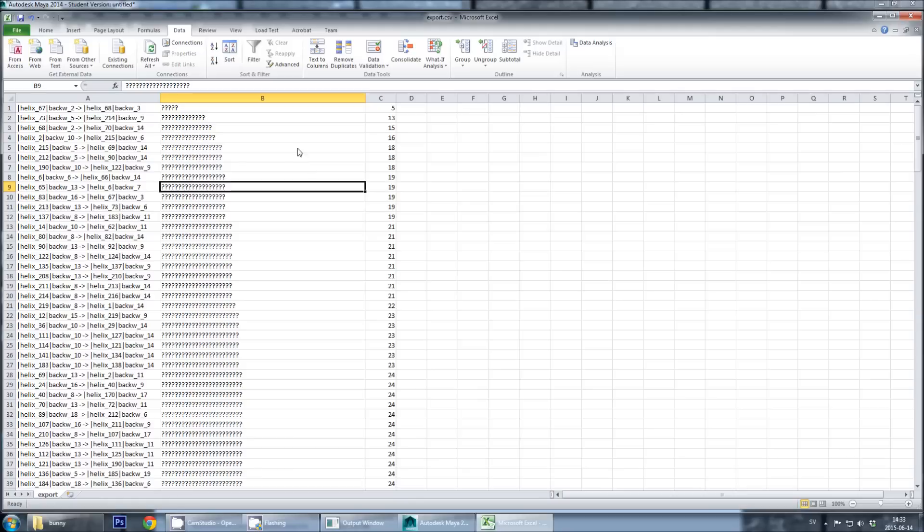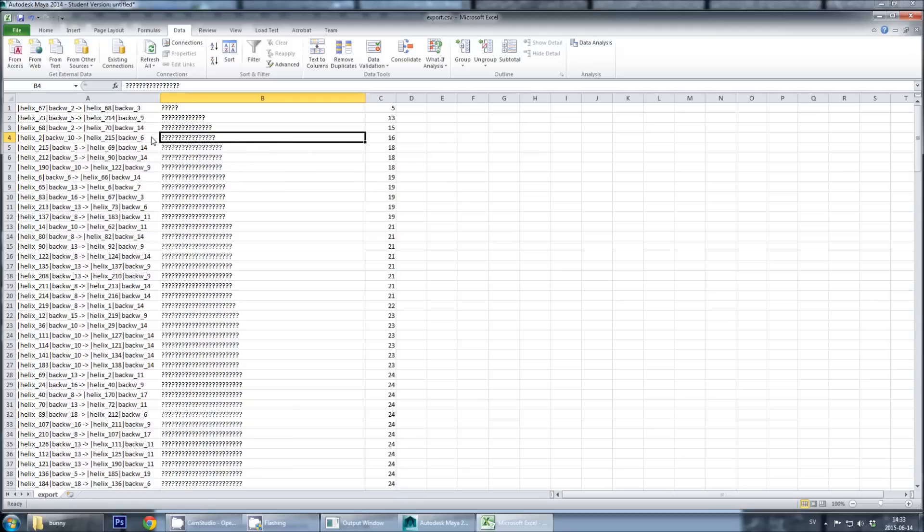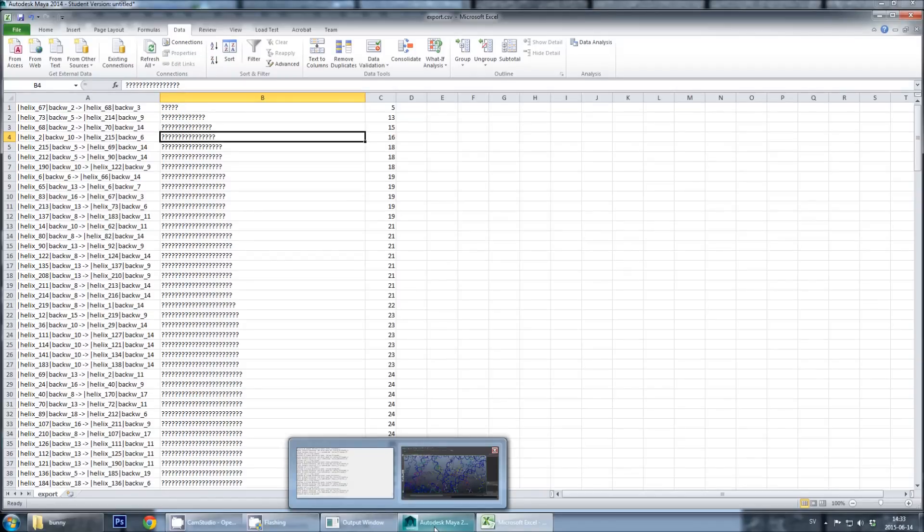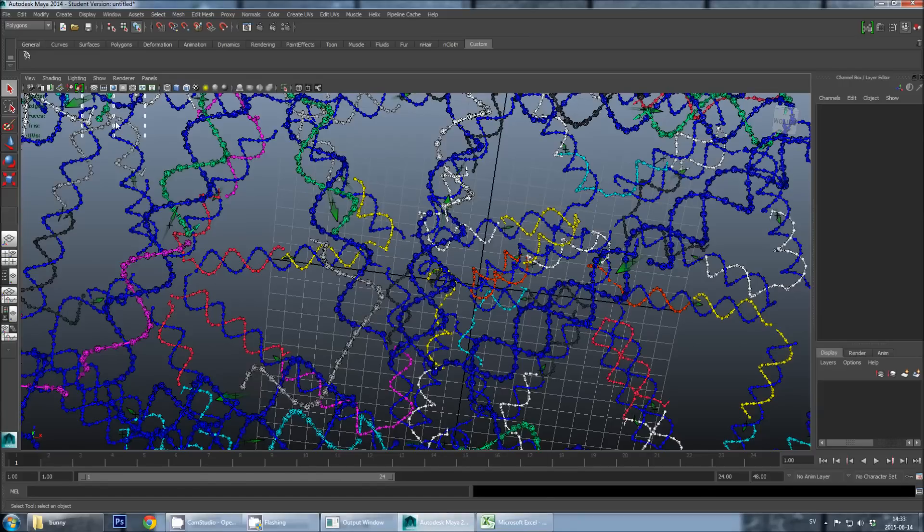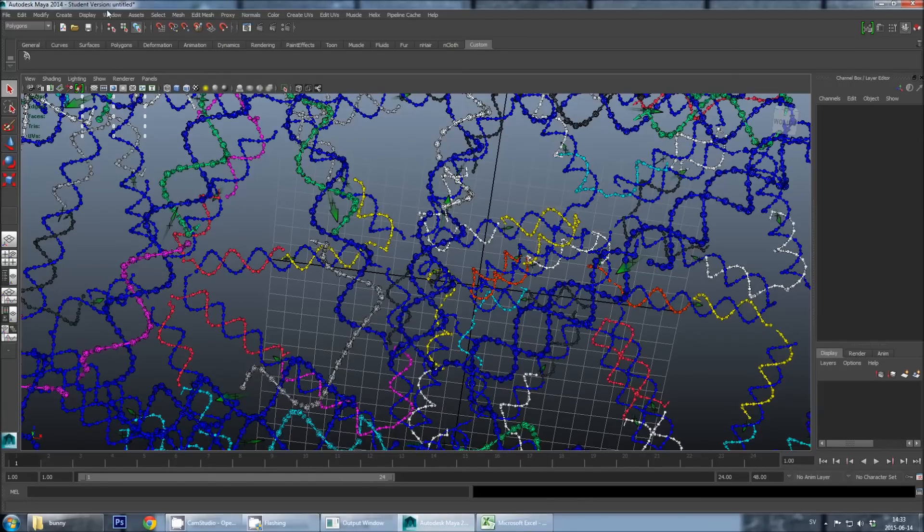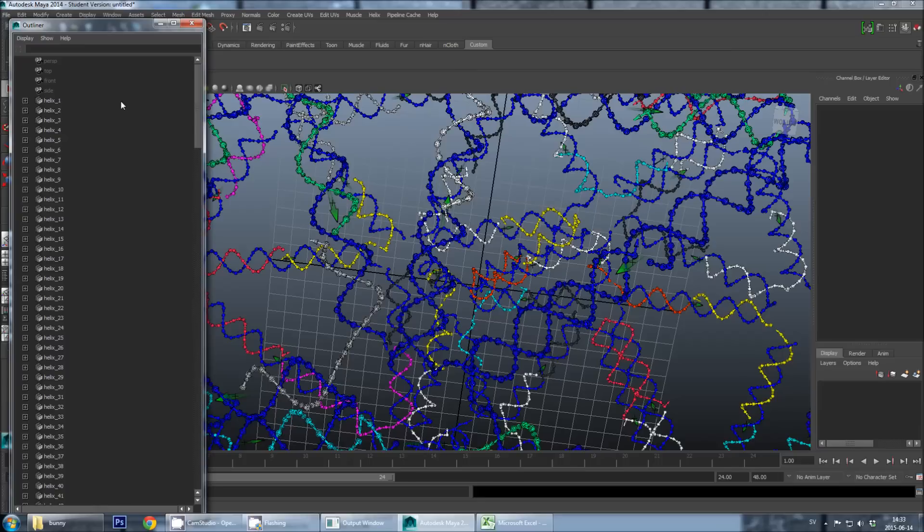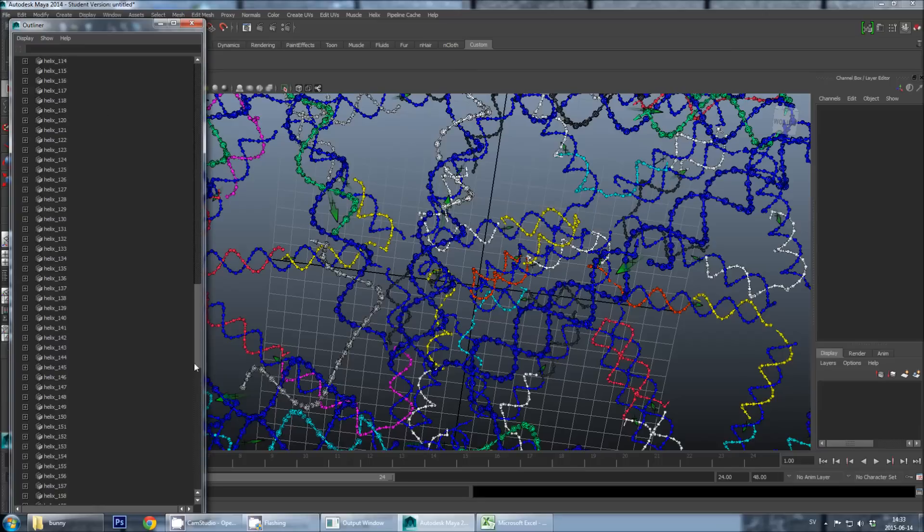So let's say that I want to look at this 16 base sequence here. I read the name of this staple, and it's Helix 2 to Helix 215. So then I go back into Maya, and I choose Window Outliner. And in the Outliner I see the name of all the helixes in my design.